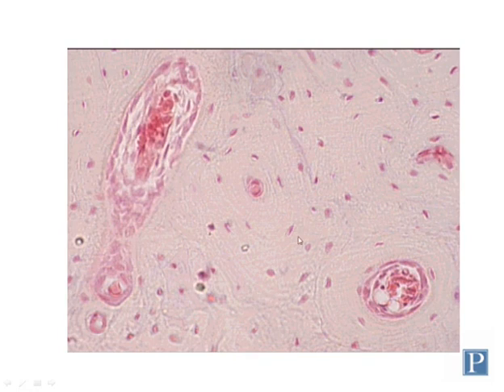What you can also see at high magnification are the osteocytes, which are the cells that help to maintain the bony matrix. And because that matrix is solid, these osteocytes are found deep within these lacunae. Later on, we're going to show you cells that give rise to osteocytes, which are called osteoblasts.